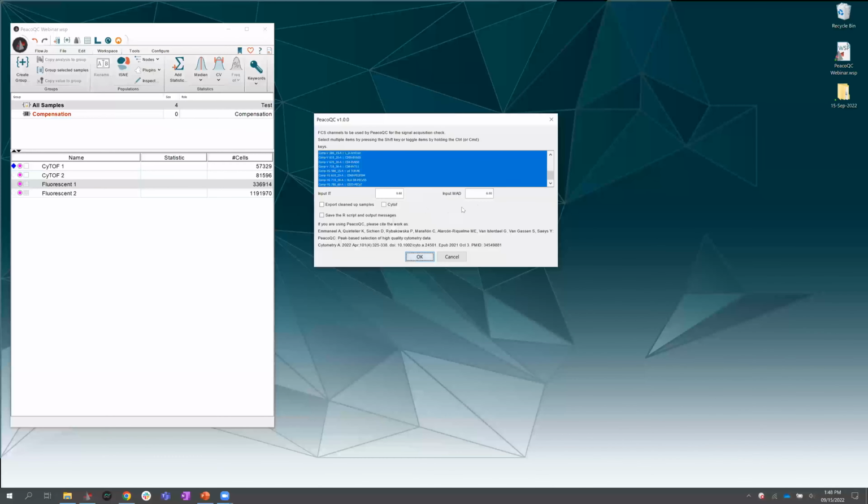Here's the opportunity to modify the strictness of the algorithm, right? So again, the isolation tree value, if you lower that, it's going to become more strict, right? And here's a reminder for that if you hover over the input box. Same for the MAD value, right? You lower that, it's going to be more strict.